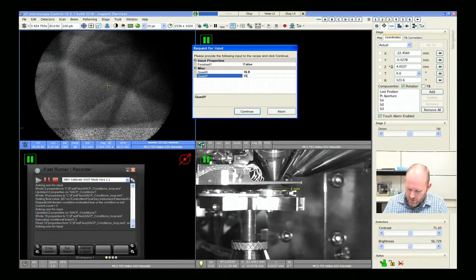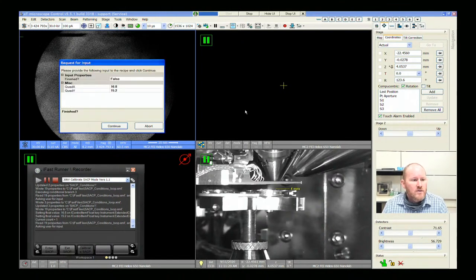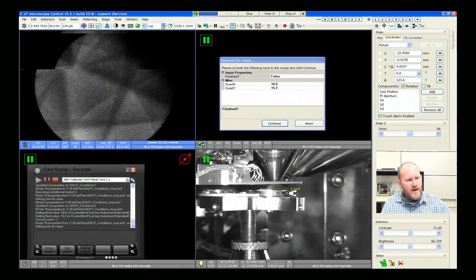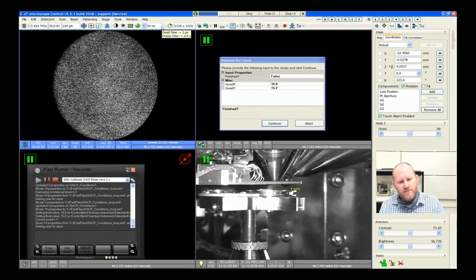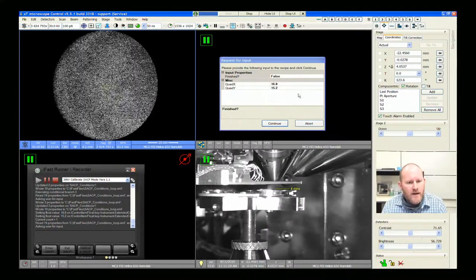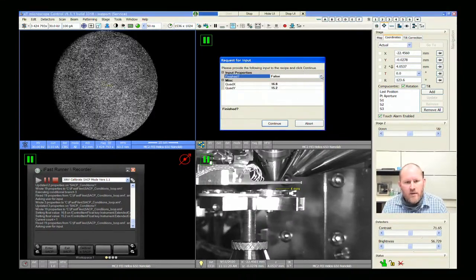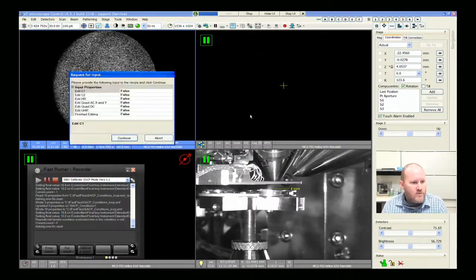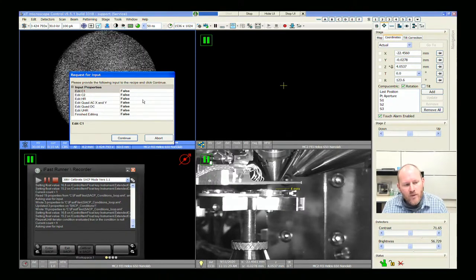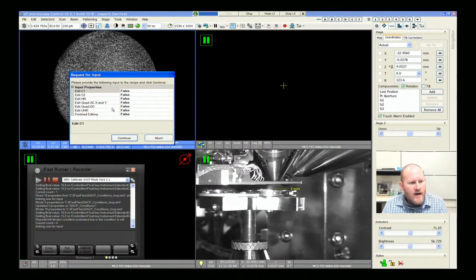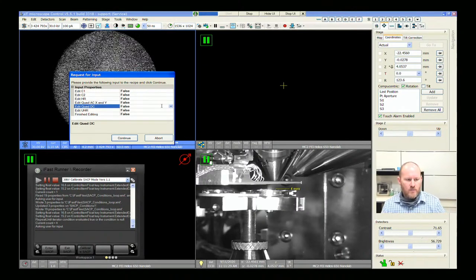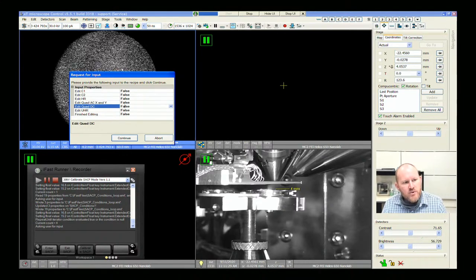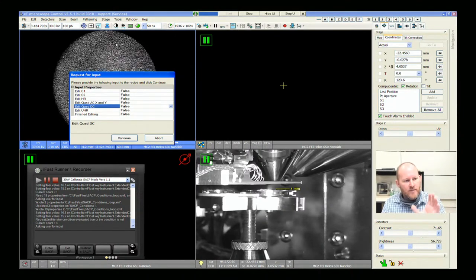The other value we liked was 15.2. Continue — we're done changing those. I'm going to just ignore the pattern for a second; I want to see the overall disc and we're just kind of filling that field of view here. So we're done changing quad X and quad Y — quadrupole scanning X and Y. The quad DC: remember I said AC is a scanning signal and DC is a beam shift. That would move this disc left or right or up or down. It looks fine to me.